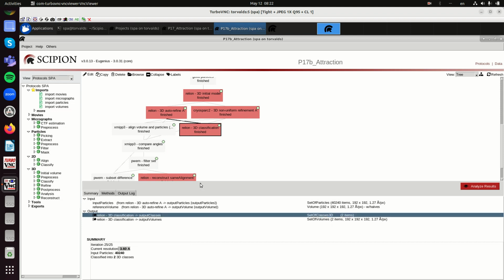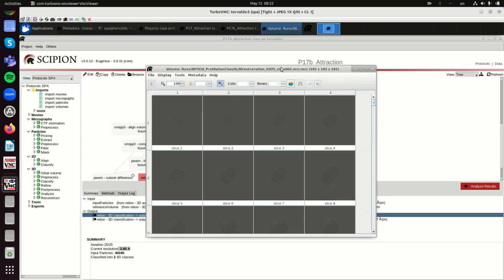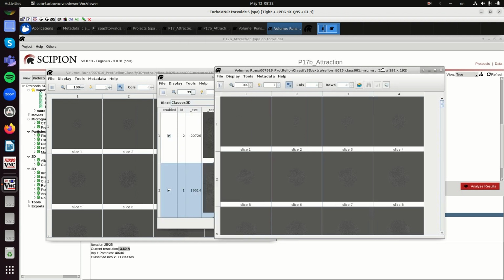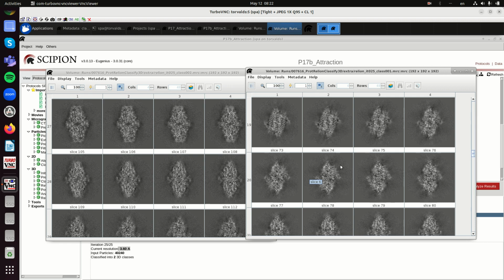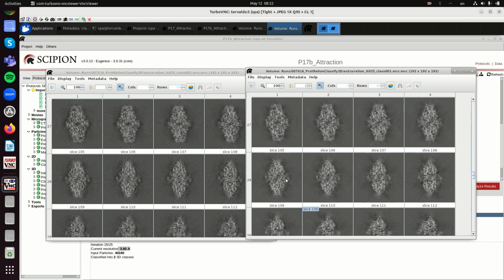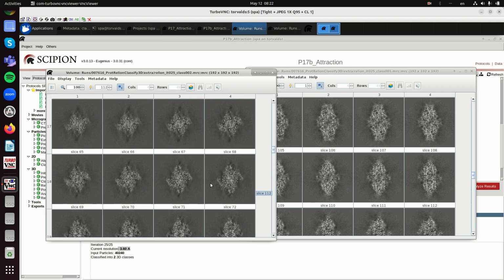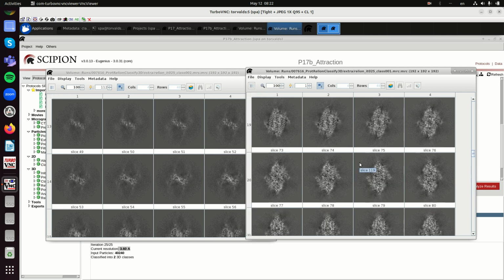We look at the two structures, and the two structures look different. This is the central slice of the two. Now you may start constructing your biological story, that these are two conformations of I don't know what, in these conditions and so on. But still, both of them have this kind of weird stuff around. You see this weird stuff here and there.